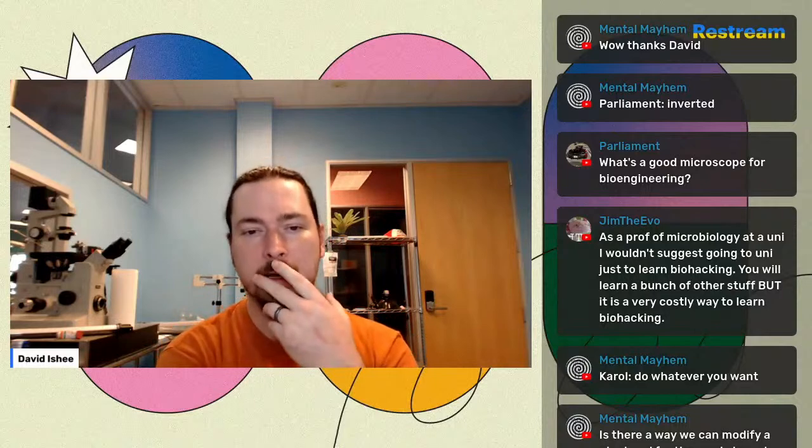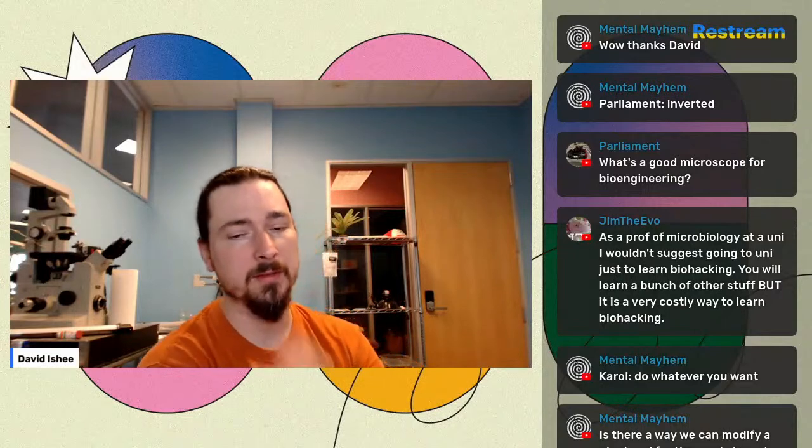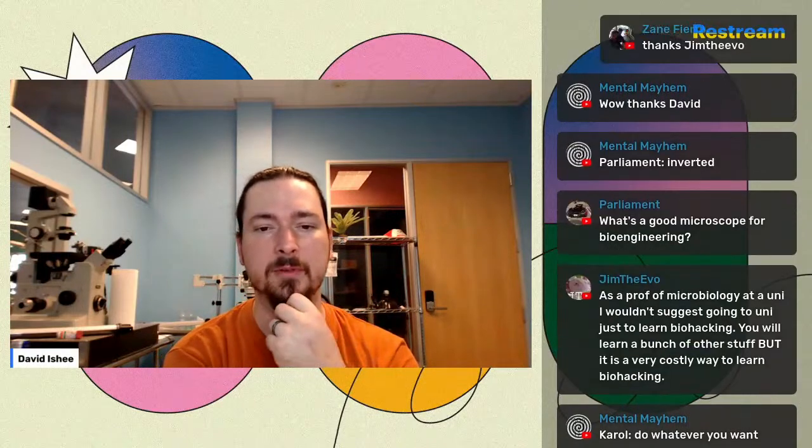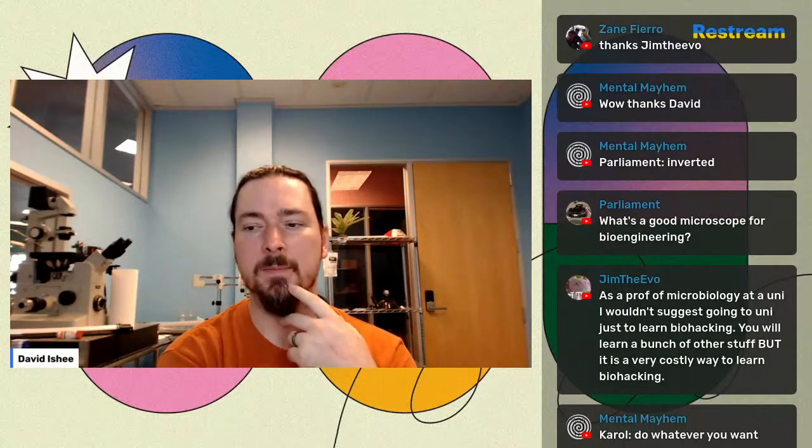When I'm working with human cells growing in culture, I'll use an inverted microscope, but you can get a super cheap inverted microscope and it's fine. If I'm using some special stuff, I'll use a fluorescent microscope or fluorescent inverted. Or when I'm working with sperm for sperm-mediated gene transfer experiments, I'll use a microscope mostly just to check their general health, but literally any microscope will do that.